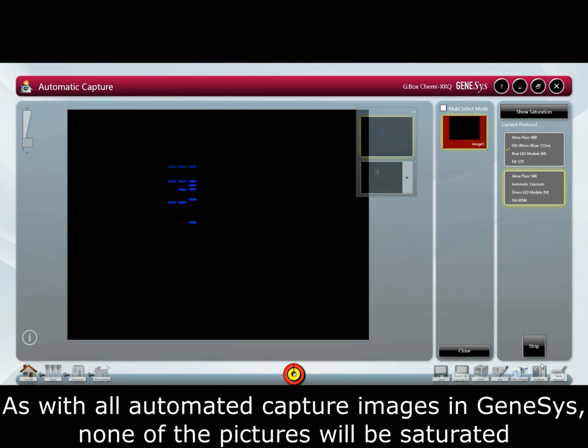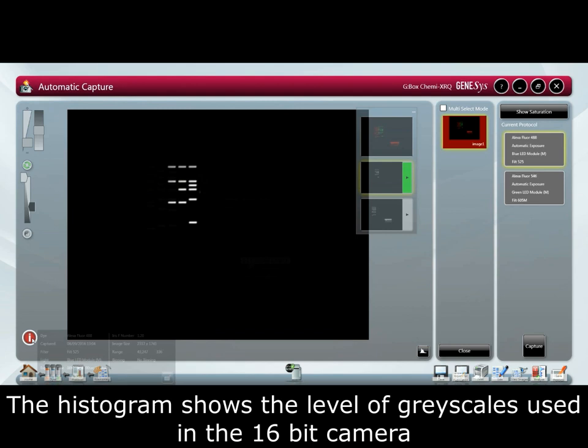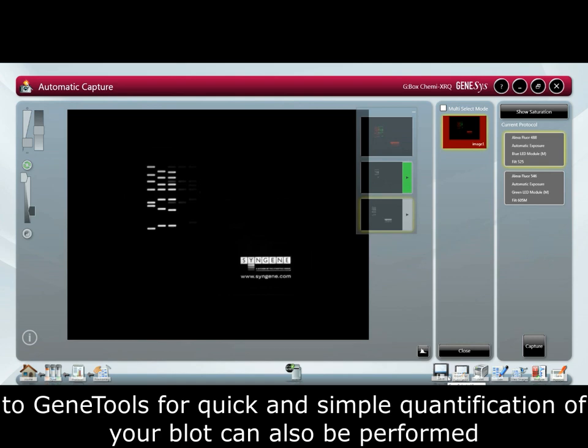As with all automated capture images in Genesys, none of the pixels will be saturated by the sample, which is ideal for quantification. The protocol can be saved to the home screen to save time when setting up future samples. The histogram shows the level of grayscale used in the 16-bit camera. Band colors can be edited for user preference, and annotations to the image and direct export to Gene Tools for quick and simple quantification of the blot can also be performed.